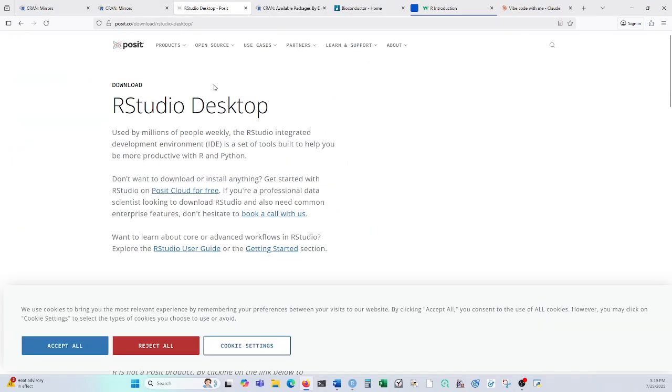Anyway, now that you have R, let me just bring up R really quick. The R program itself, you can code on it, but it's not very effective. A lot of people use shells to actually run it, including myself. I use RStudio, which is also free.